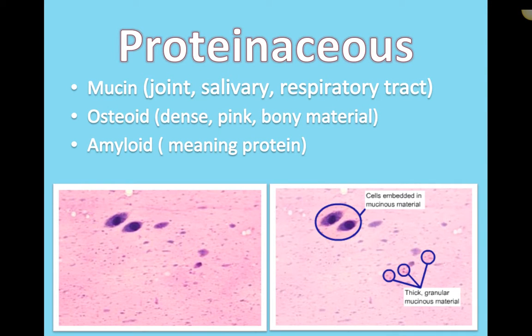Proteinaceous, we've looked at proteinaceous samples probably at this point in the class. I know that we did look at one line smear already. I think it's sample C85, and it's an inflammatory sample. In the background, line smears are really nice to identify proteinaceous samples because your whole sample is sitting on a line, more or less. So you're able to identify, is that background proteinaceous or not, by skipping from the line of cells and back to an area where there's nothing.